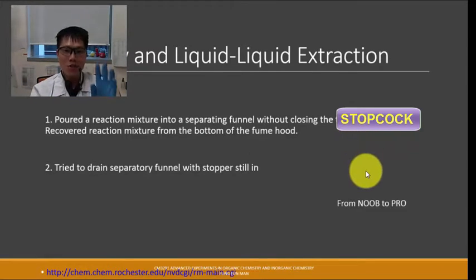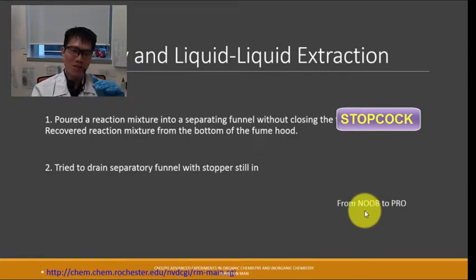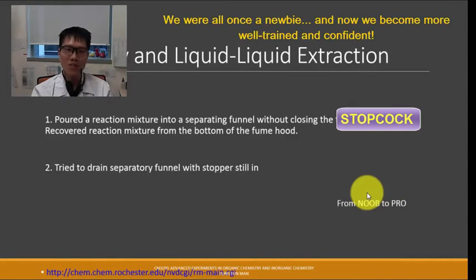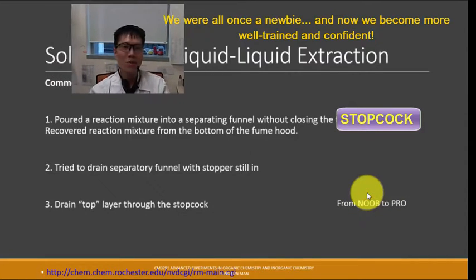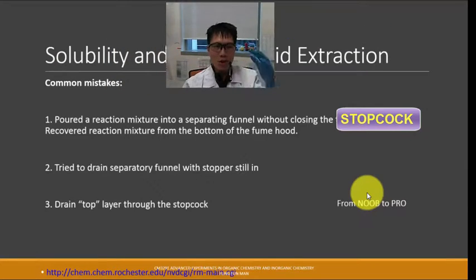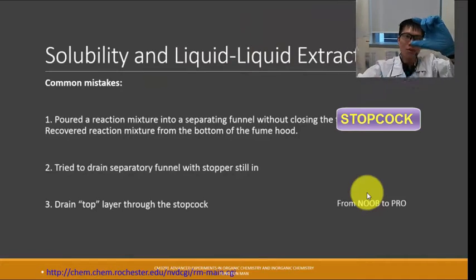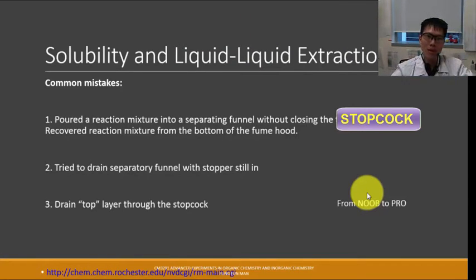You are now year 3, you should be a pro, because in the last 2 years you were maybe newbies. Practice a bit more, be more confident. And the last mistake they make is they drain the top layer through the stopcock. So remember, 2 layers: the bottom comes out from the bottom, the top comes out from the top. Don't mix them up. Don't do it just for convenience.